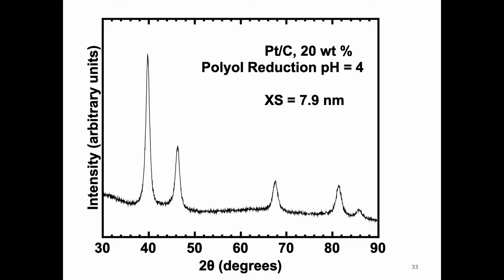But here, I want to caution you, with these crystallite size measurements, the accuracy of these numbers is quite low. And so I tend to not give a lot of significant figures because there's quite a bit of error in these measurements. I usually refer to it as an estimate of what the crystallite size is. So that's something to keep in mind.